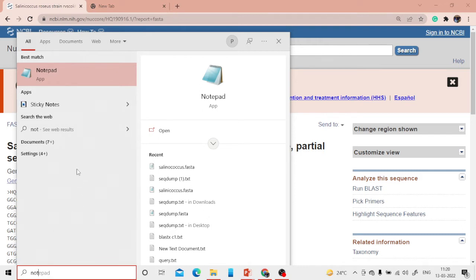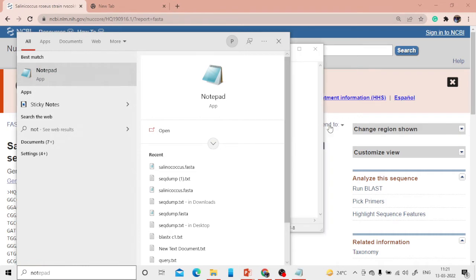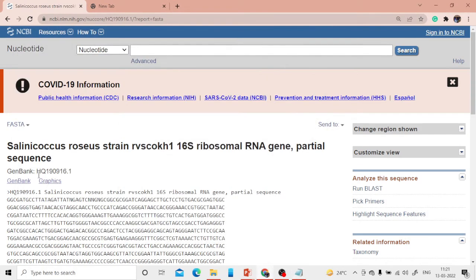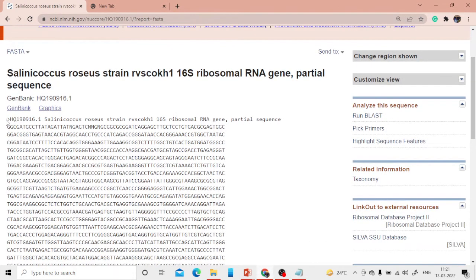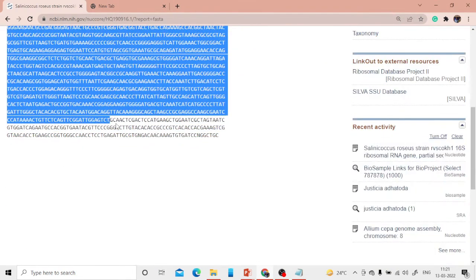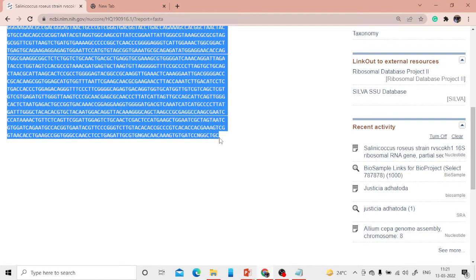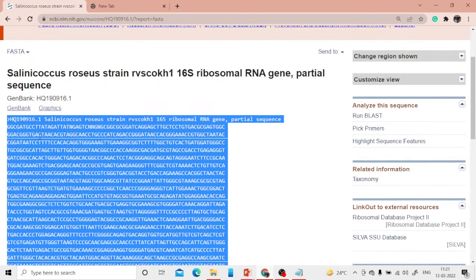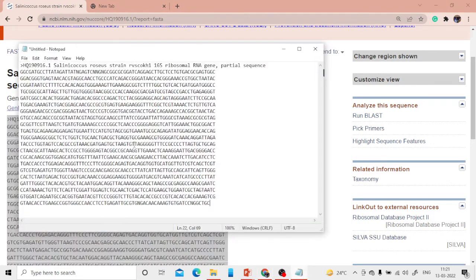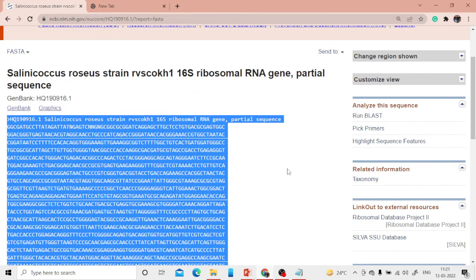While copying the FASTA file, make sure it starts with the greater-than sign. Students often miss this sign and face difficulty. You can see the entire FASTA format has been copied and pasted. Now, since we need homologous sequences, we'll run BLAST from the entire database.